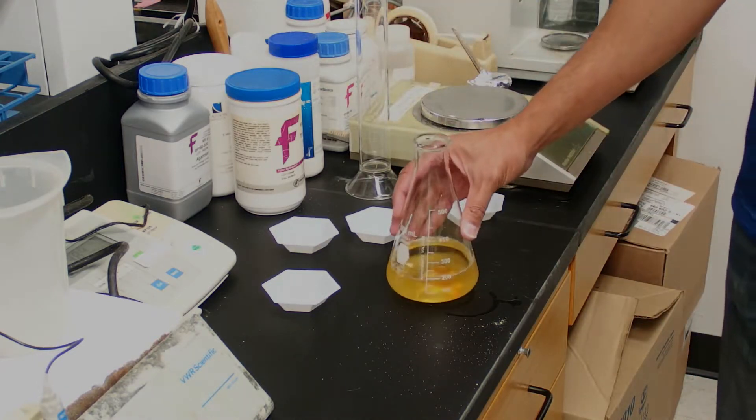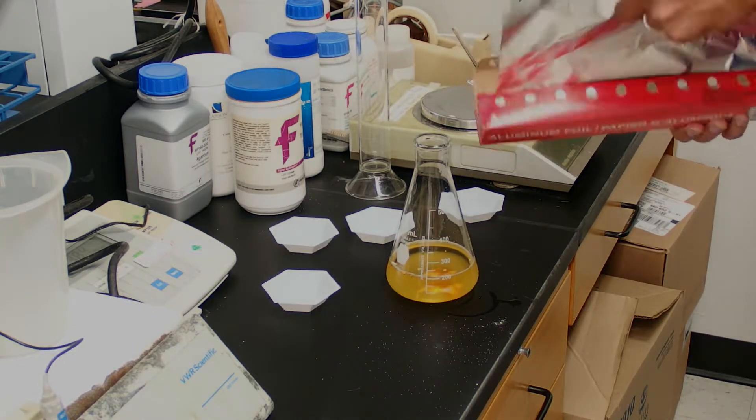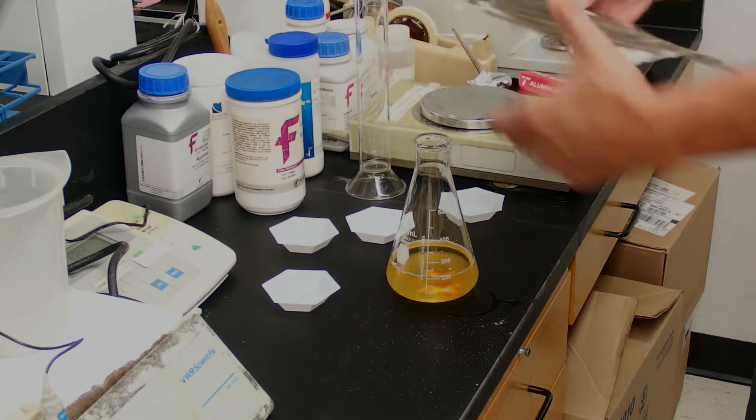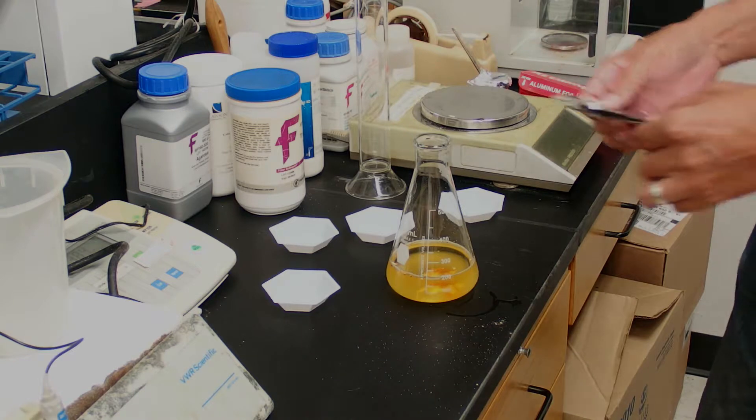Then we have to cover this with aluminum foil. We'll cover the mouth of that Erlenmeyer flask with the shiny side of the aluminum foil.